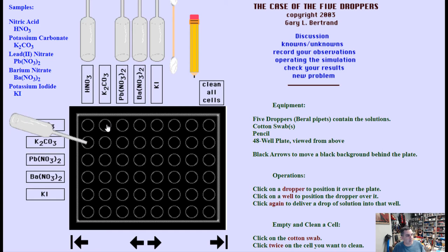Here we go, I'm going to put my potassium carbonate right there. I put two drops, you don't have to put two, you can put one. And then since I have potassium carbonate here, I'm going to grab some nitric acid, grab this one, and I'm going to make sure I put it in the same cell. Look what happens, I click and drop one in. Oh check that out, I got some bubbles! That's pretty cool.